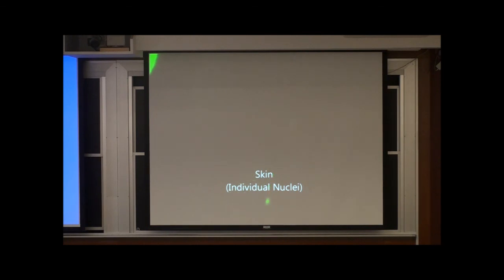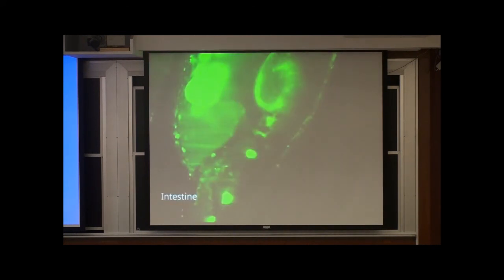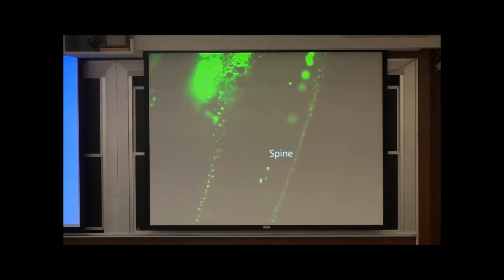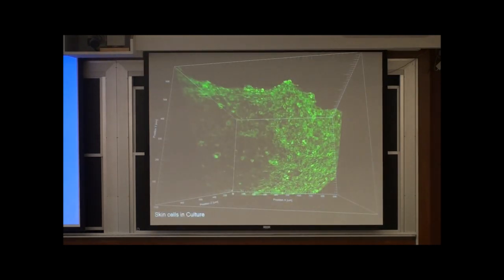But in some portions of the tissue, as it is tissue imaging, there is a high amount of scattering. Suppose these are the areas. So this method is not solving all the questions, and there is also a chance of development on that side. I will come to that part.